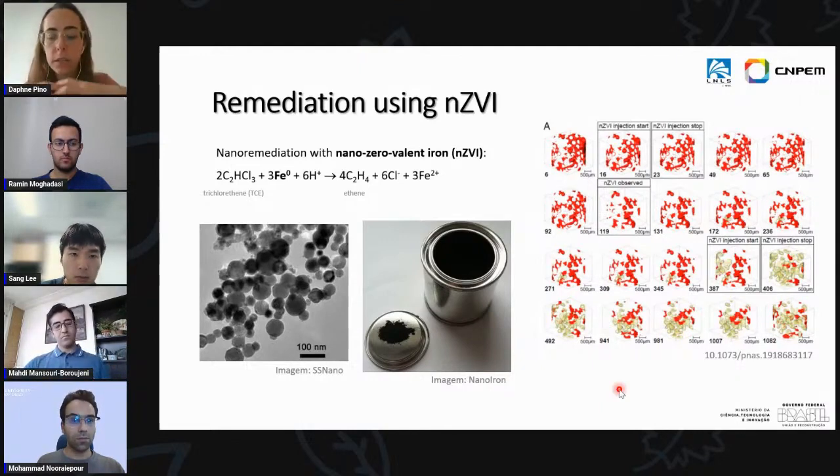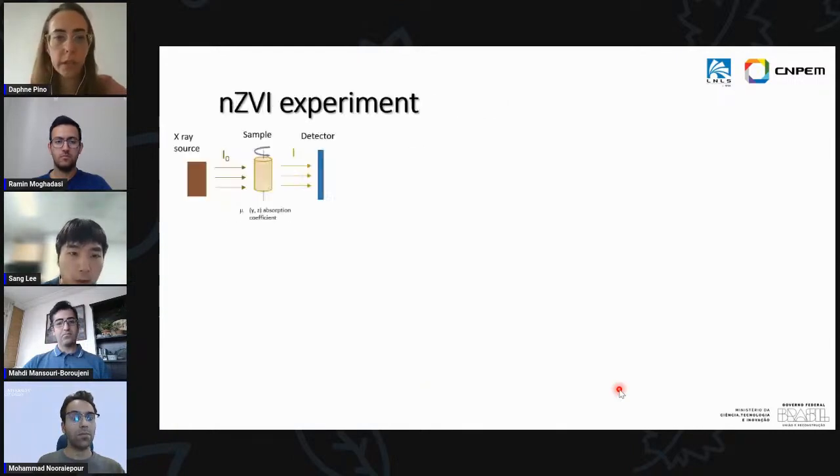So this was very interesting, and this could only be done using synchrotron light, not only because we had to see things at a very small scale, but also because we were able to image the process at different times. So in a synchrotron beamline, you can also have images at different times, so you have resolution in time as well. You can almost make a movie of what is happening in your sample when you have an injection experiment.